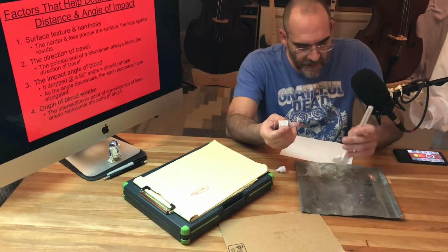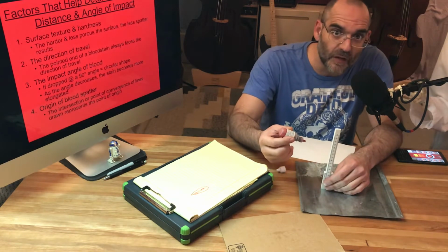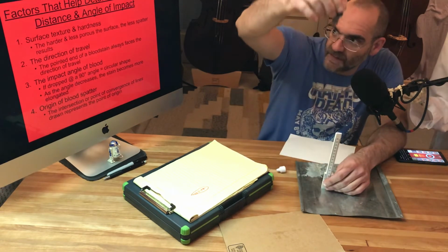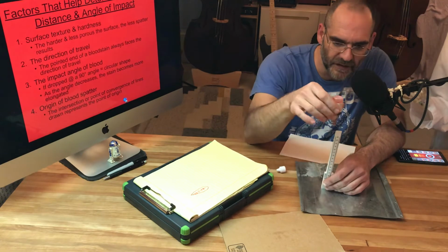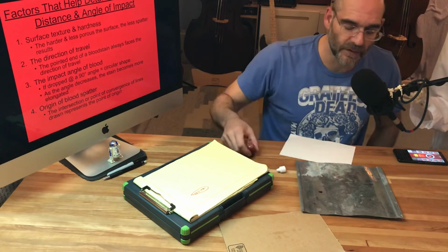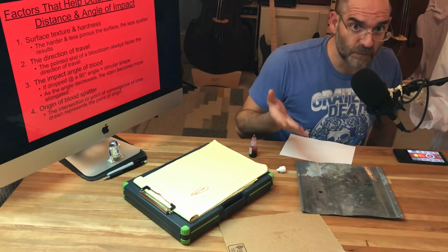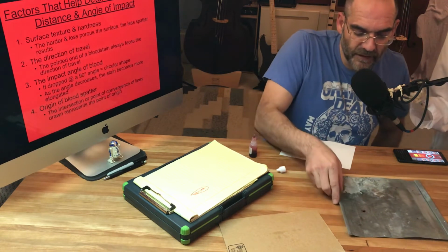Now, of course, good scientists are consistent, so I used to make you drop this from a set height. We also looked at the higher the drop, what the spatter looked like at different heights too. It was a fun lab. But anyways, I'll just use this as an example. Boom. Okay, so notice that that drop hit and then kind of goes back together. Blood is mostly water, and so it's attracted to itself, so we made a spatter that size.